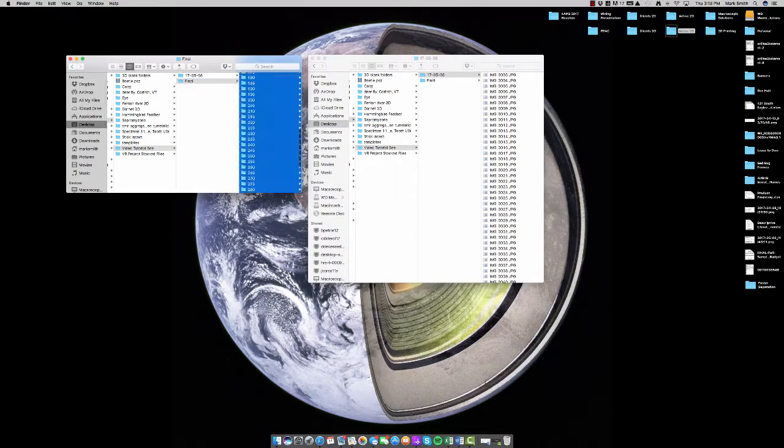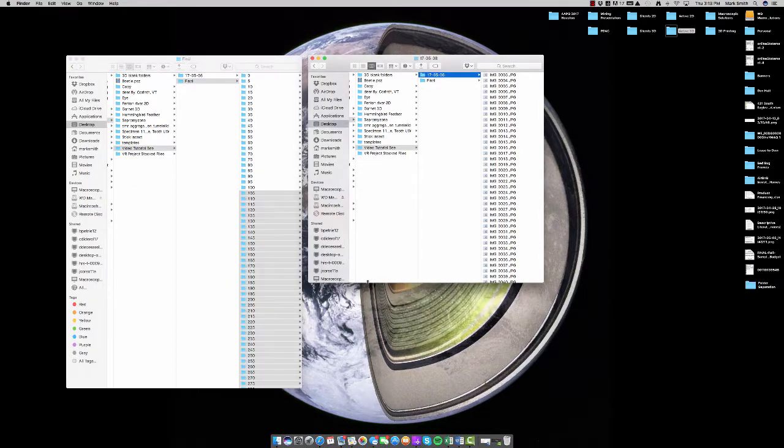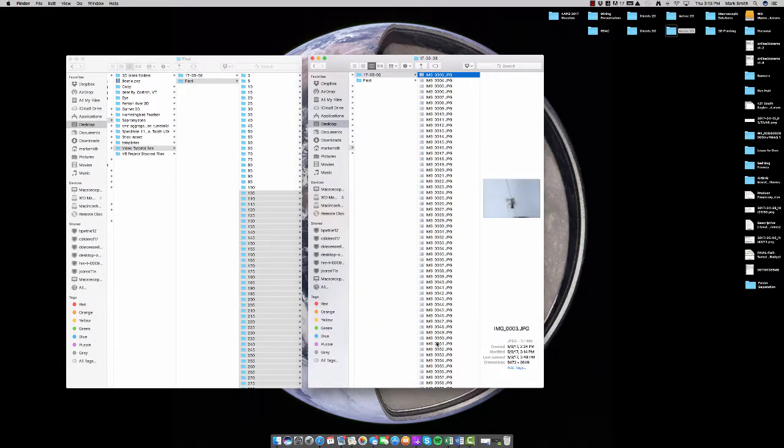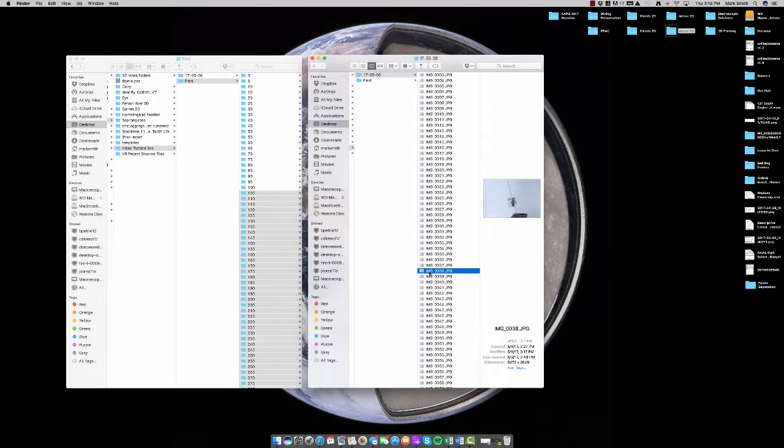So the first way to do this would be to expand these two windows and try to highlight 36. So that's 49. We'll just go, so there's the 36, 35, this is 36. So this is going to be your cutoff, and you can double check. You can see the window over here. If I just went to 39, you can see how the focal plane changes, and that's because it was reset after a small 5-degree rotation.